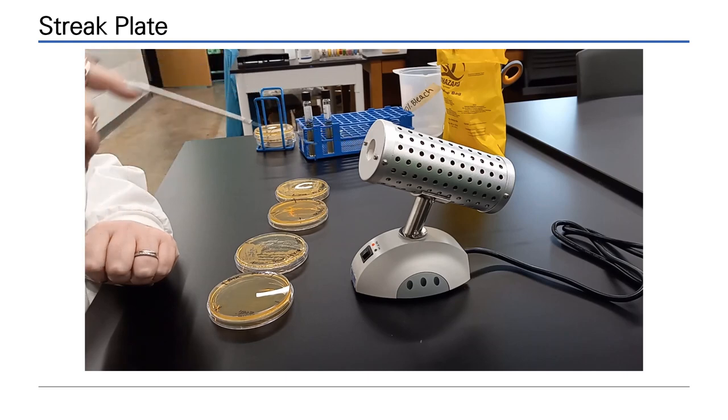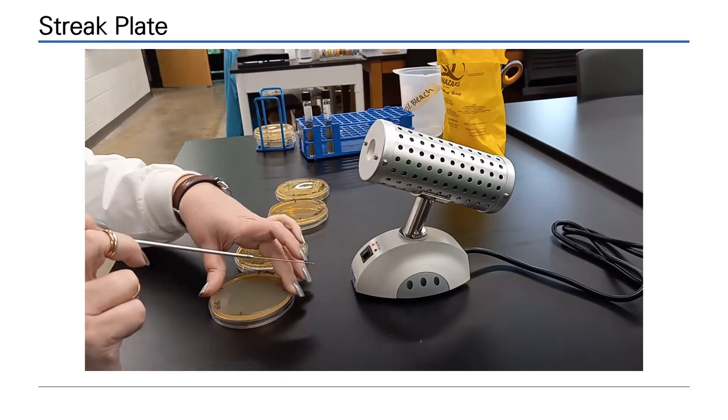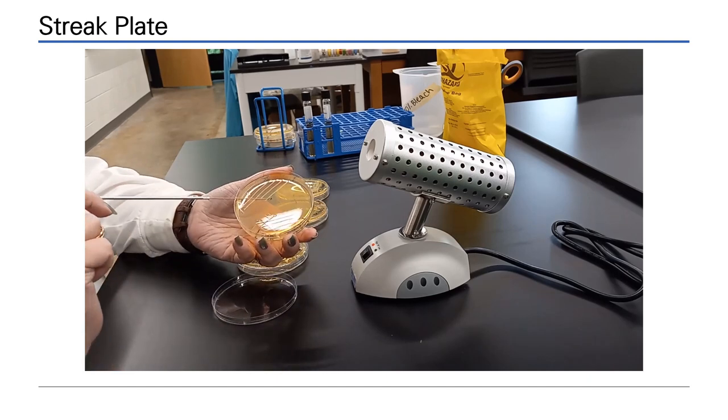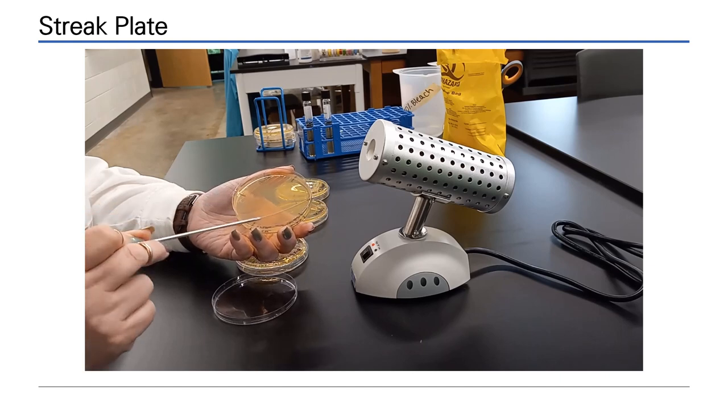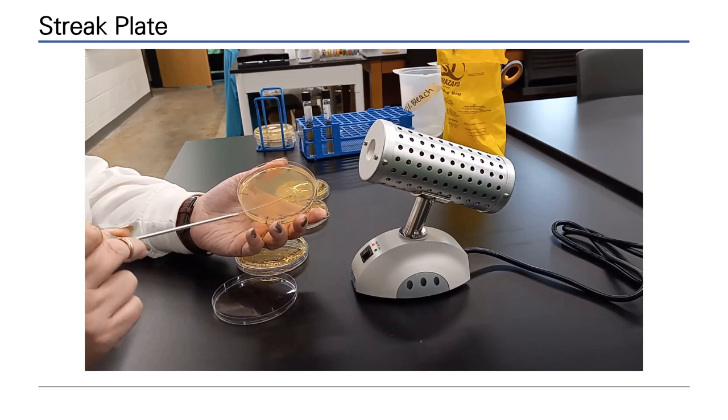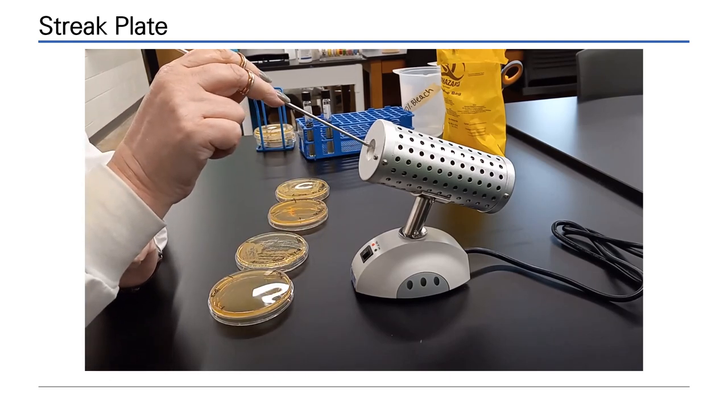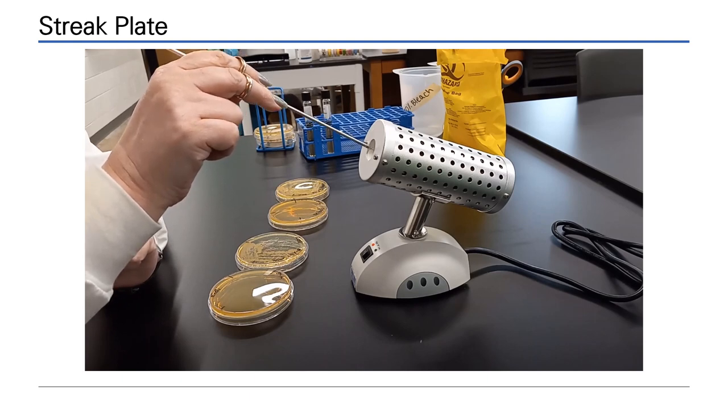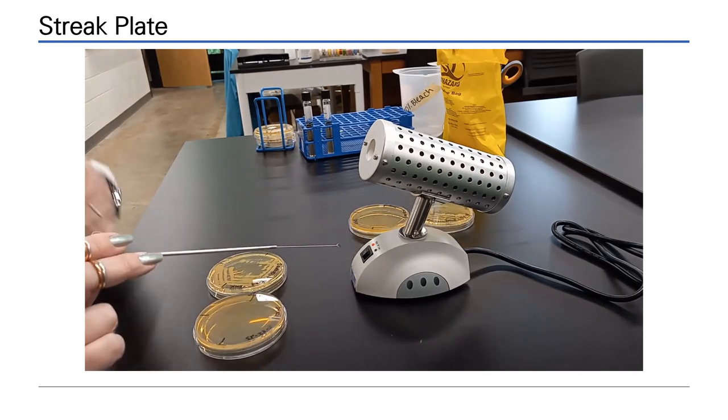The fourth quadrant is streaked in a slightly different way. Traditionally, you enter the third quadrant, drag the cells across and zigzag into the center. Sterilize the loop. The quadrant streak plate is complete and will now need to be incubated overnight to allow for growth.